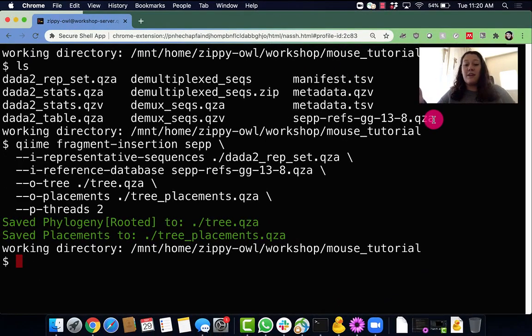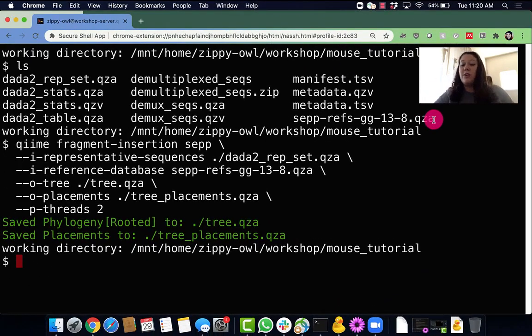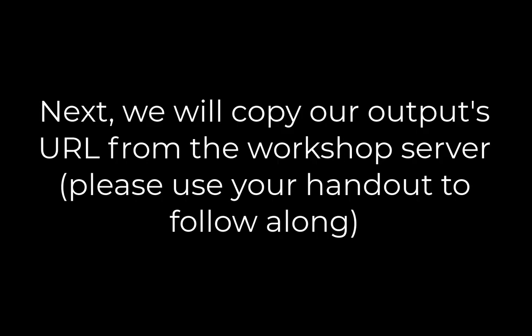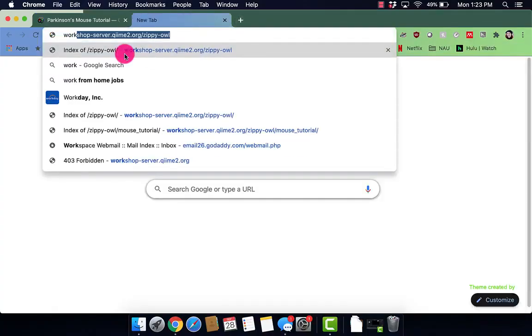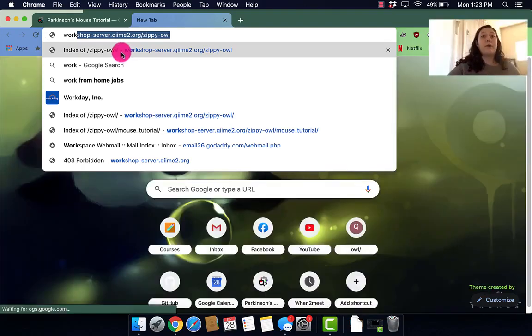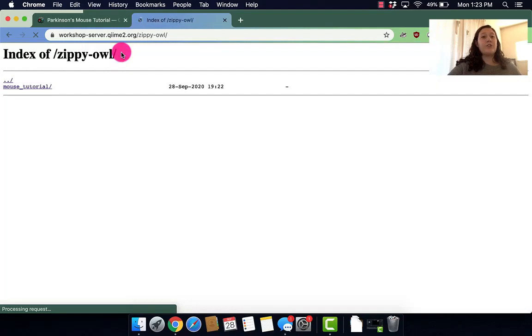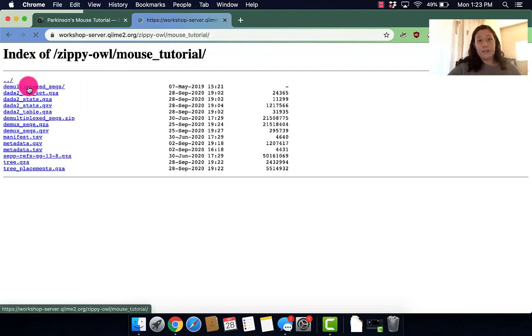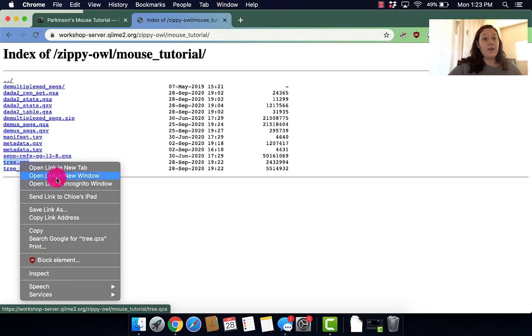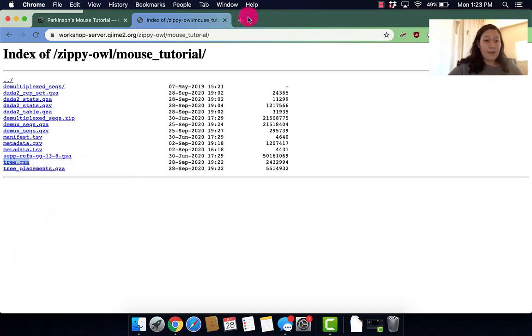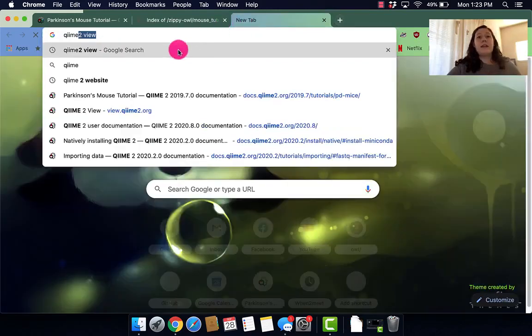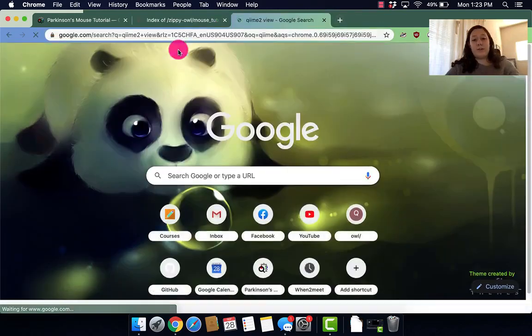So my command has finally run. And let's go take a look at these outputs in QIIME2.view. I'm going to go to our workshop server visualization workshop-server.qiime2.zippyowl to look at my data. I'm going to go down here to the tree.qza file. I'm going to right click that and copy link address. Then I'm going to head over to QIIME2.view.